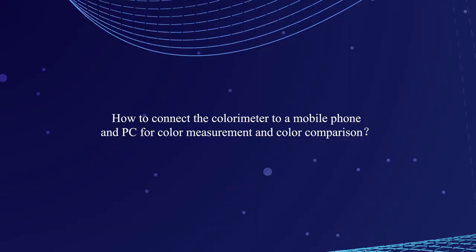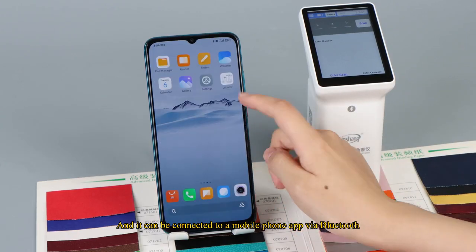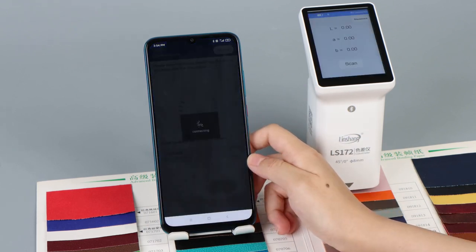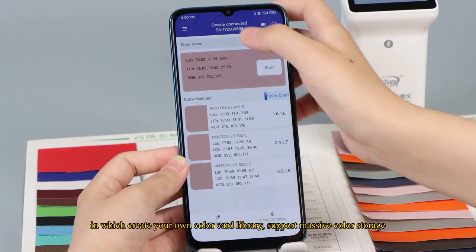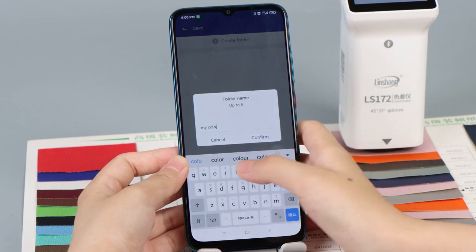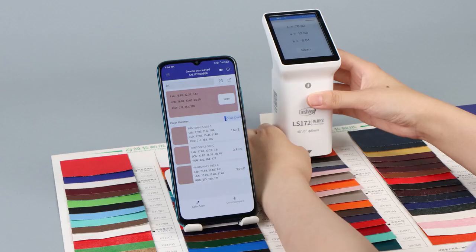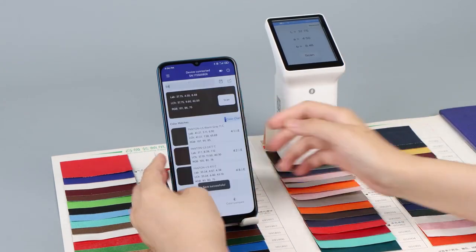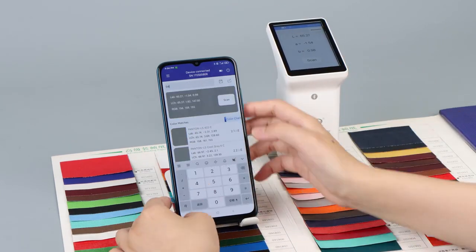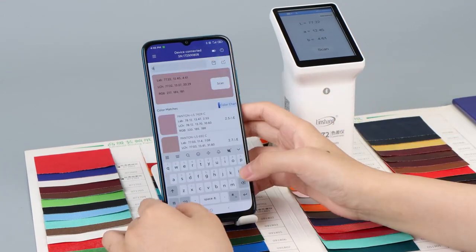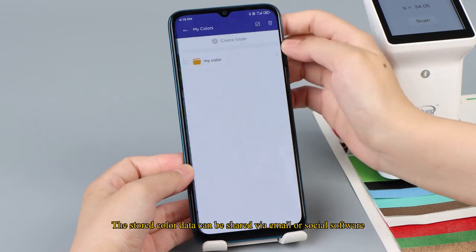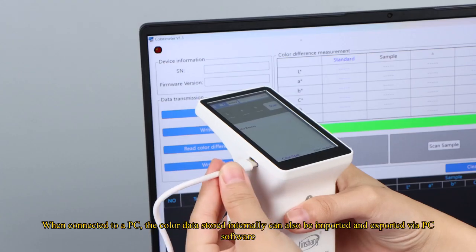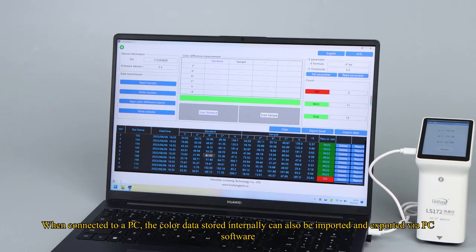How to connect the colorimeter to a mobile phone and PC for color measurement and color comparison. It can be connected to a mobile phone app via Bluetooth. In which create your own color card library, support massive color storage. The stored color data can be shared via email or social software. When connected to a PC, the color data stored internally can also be imported and exported via PC software.